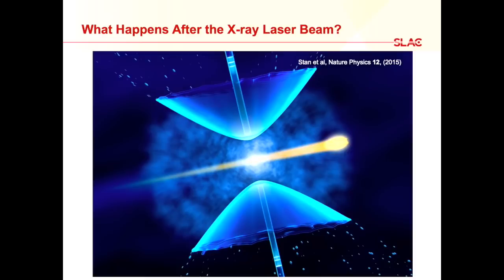So, and this is part of the original figure that I showed. I really need to acknowledge Claudio Stan, who has now moved on to Rutgers University. These types of measurements happened all because of him. These beautiful movies were really all due to him. And so the X-rays come in, they vaporize some water, and the water causes the jet to separate and explode.